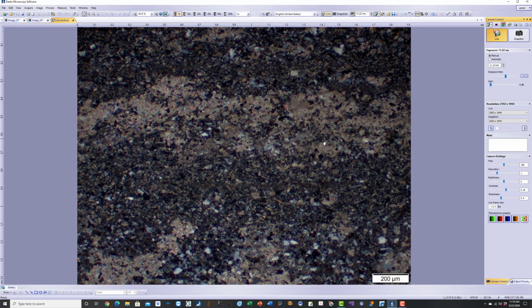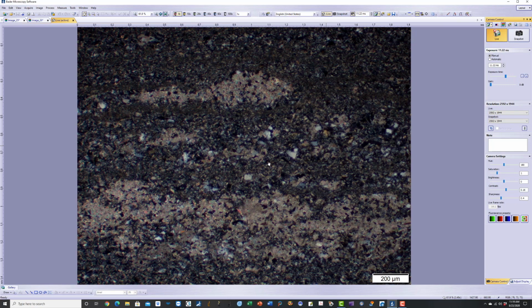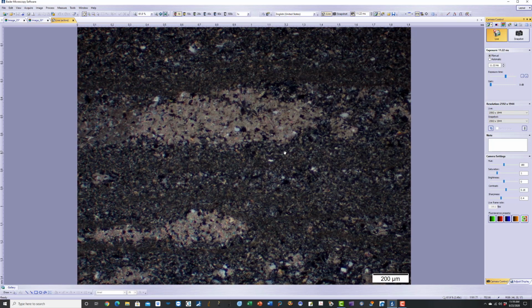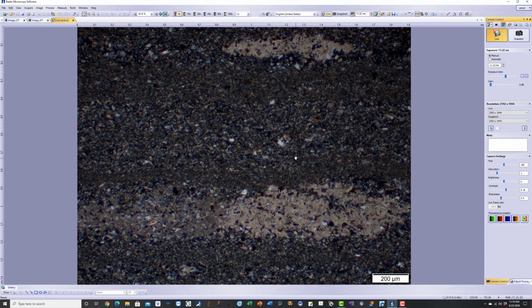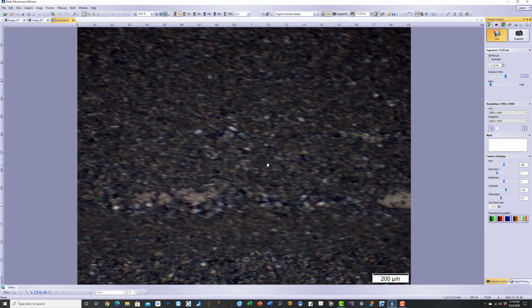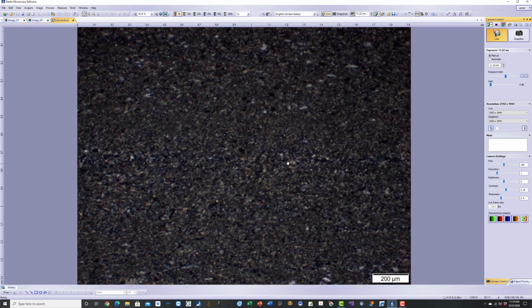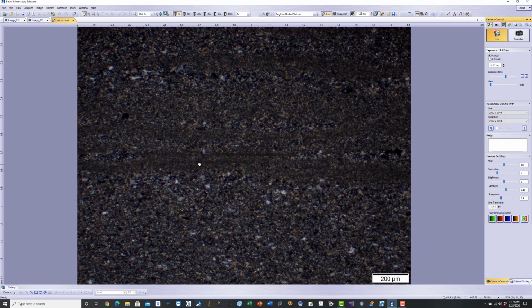Again, there is a carbonate band. So you have alternate precipitation of argillaceous and calcareous materials in the parent rock, which is the shale, which has been metamorphosed to slate by low-grade thermal metamorphism or regional metamorphism. You form this slate. There is a more or less homogeneous mixture of very fine-grained clay and silt. You have the dark brown bands which you saw in the plane polar.